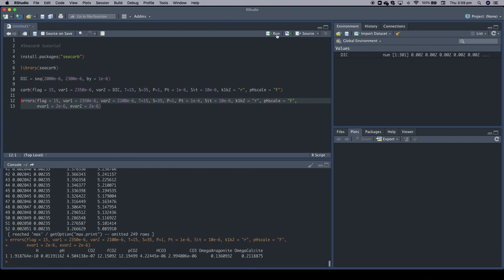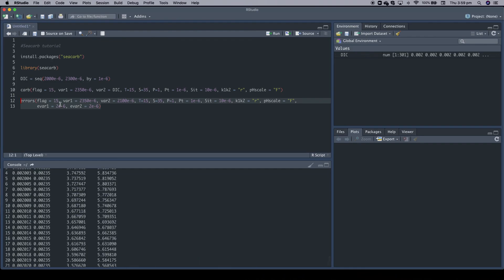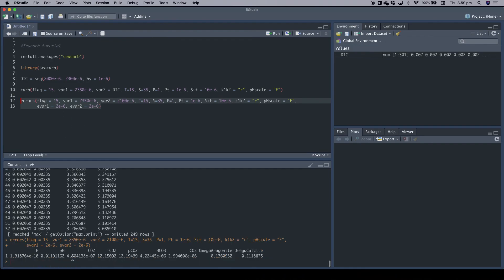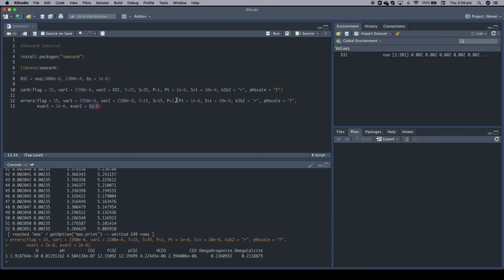So if we run it, we get this. This is the output. The output now is not the absolute value of what we got from the carb function, but it's the uncertainty, the plus minus. So for example, in our calculation, based on the uncertainties on these ones and the default uncertainties in salinity and so on, we get an uncertainty of 0.012 in pH for example, or in pCO2 of 12.2.